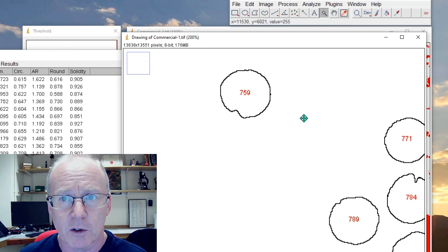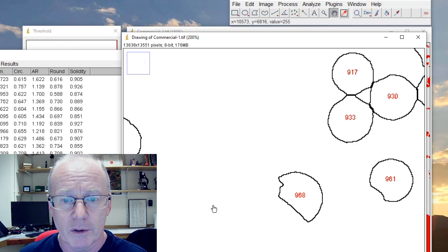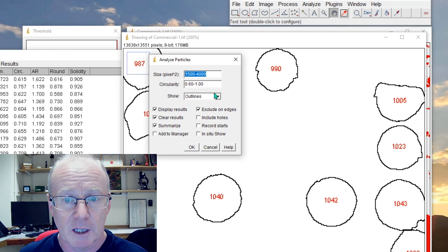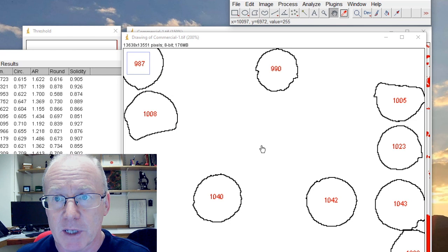Okay and then what you would do would be play around with the analyze particles parameters until it pulls out close to what you want. I could spend some time readjusting all of that, but hopefully that gives you enough of an idea of what we were trying to do.